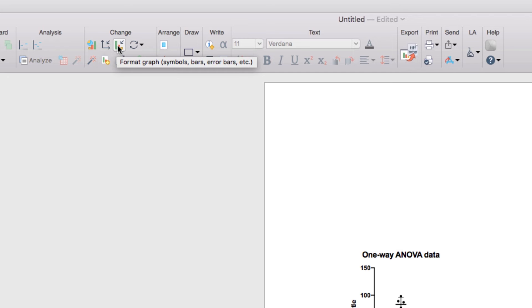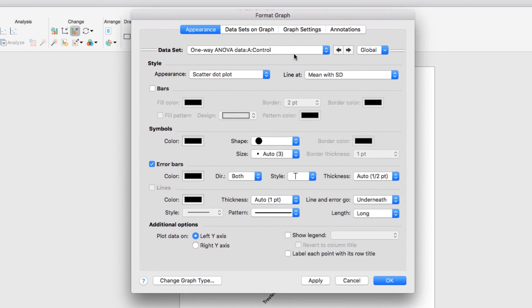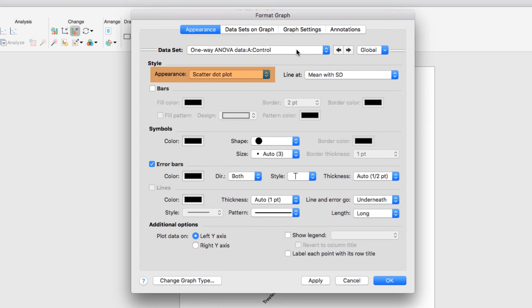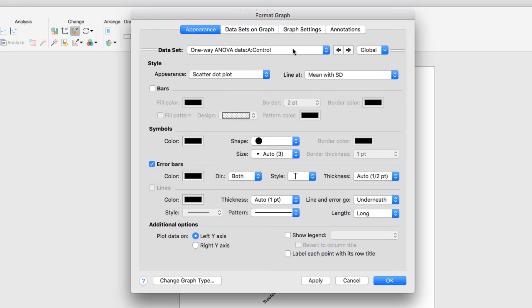The Format Graph dialog provides customization of the datasets including the symbols, colors, shapes, line weights, and other appearance options for your graph. Here you can see you can select the dataset you want to change, you can select the appearance, how the line and error are shown, the color of the symbols, the shape and size of the symbols, the style of the error bars, and many many other options.